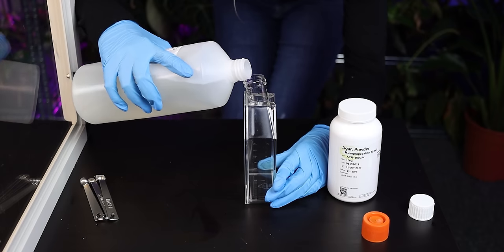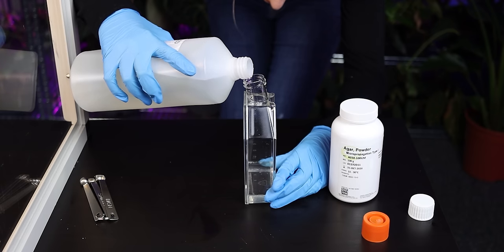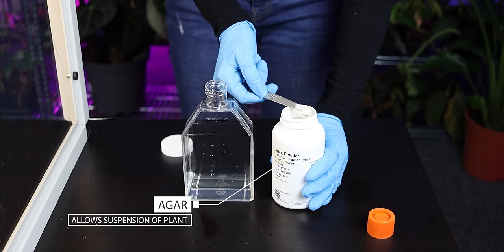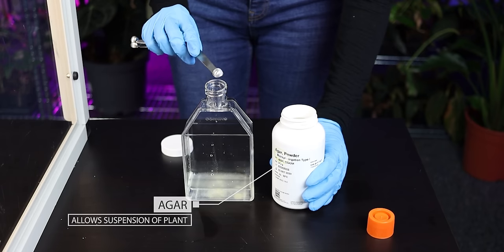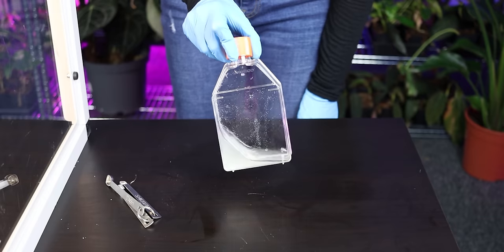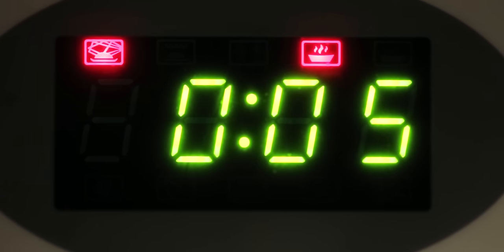Now that we're good to go, I'm measuring around 45 milliliters of our prepared solution into our tissue culture container. To this, I'm adding agar, which is basically a vegetarian gelatin substitute produced from a variety of different seaweeds. This makes the medium firm and allows the plant material to be suspended. After giving this solution a little bit of a shake, I'm going to boil it in the microwave. Now, in laboratory conditions, this would likely be done in an autoclave. However, this is kitchen culture and I don't have an autoclave, so a microwave is just going to have to do.